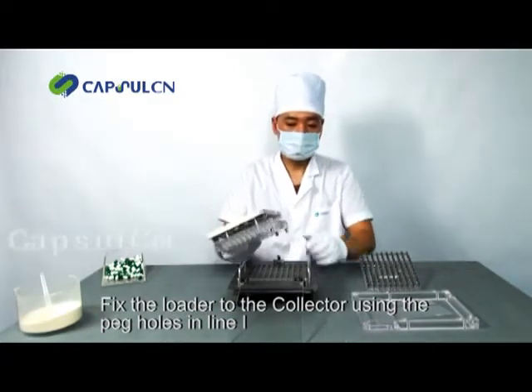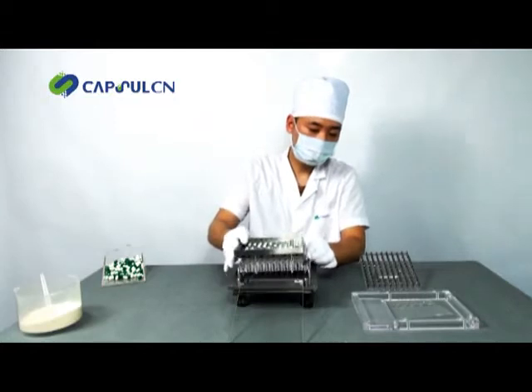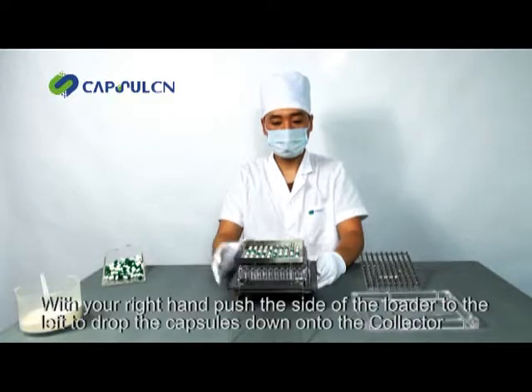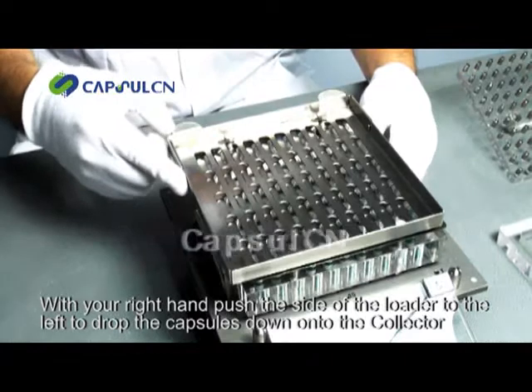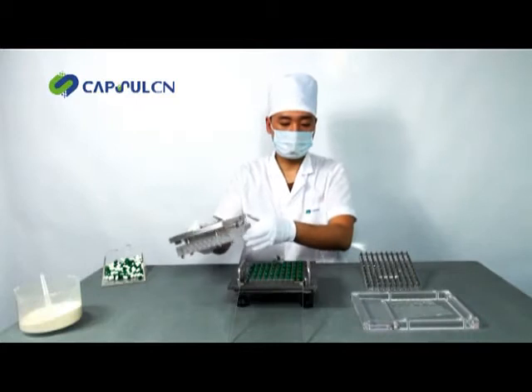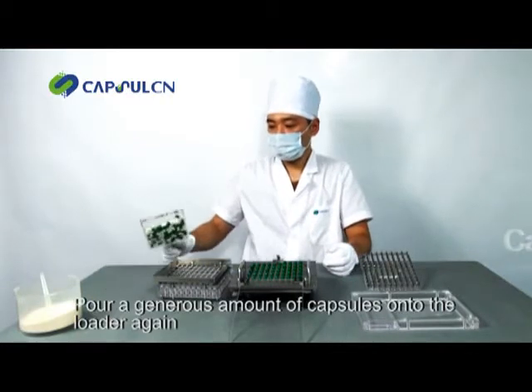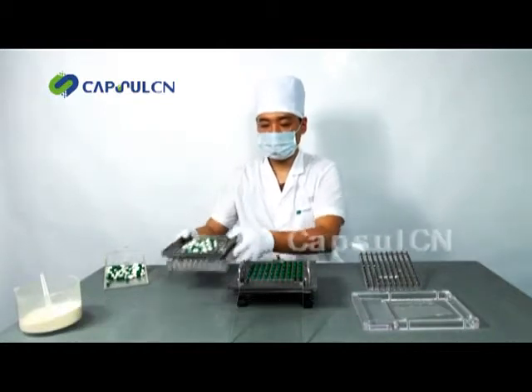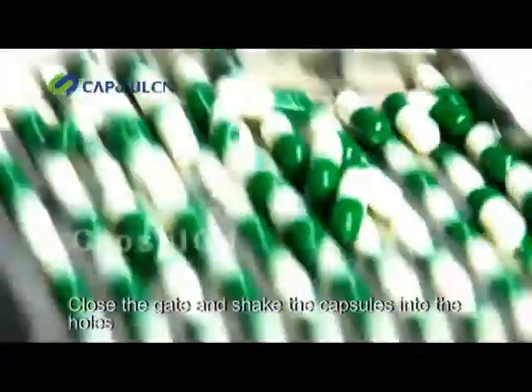Fix the loader to the collector. Use the peg holes in line one. With your right hand, push the side of the loader to the left to drop the capsules down onto the collector. Pour a generous amount of capsules onto the loader again. Close the gate and shake the capsules into the holes.